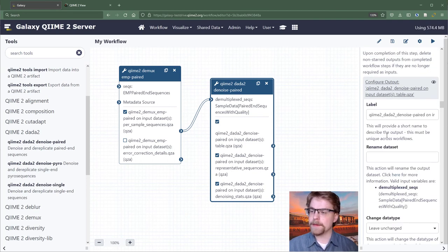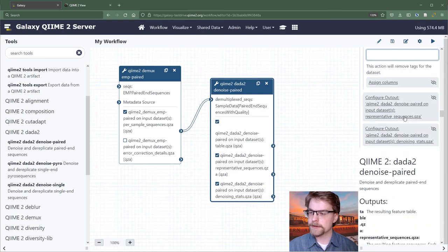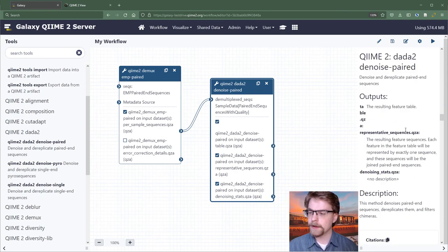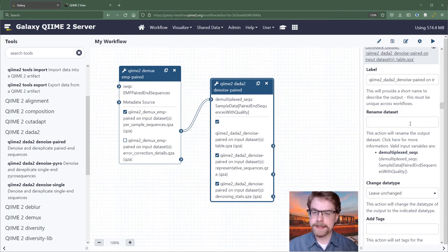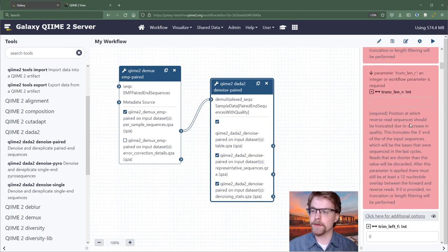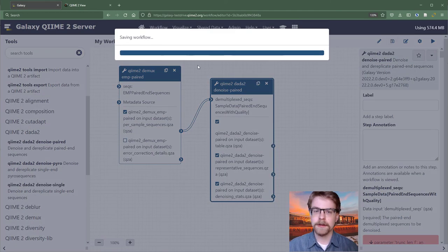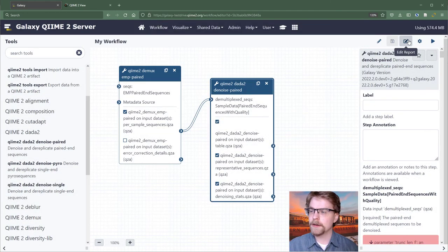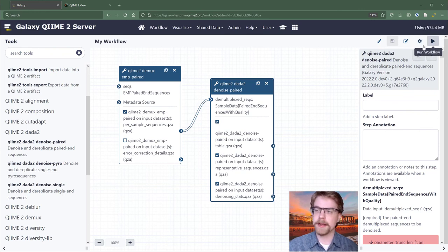And so this is just like that tool window, but in the sidebar now. We can also rename outputs. We can add tags, remove tags. There's a whole lot you can do. And then once you're basically happy with your workflow, you could save it.